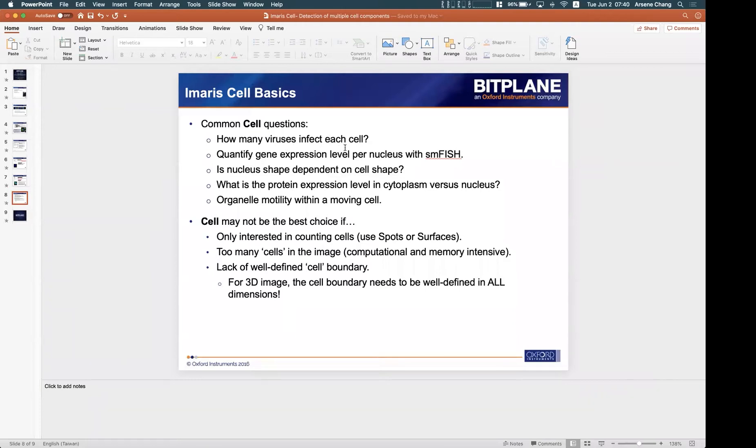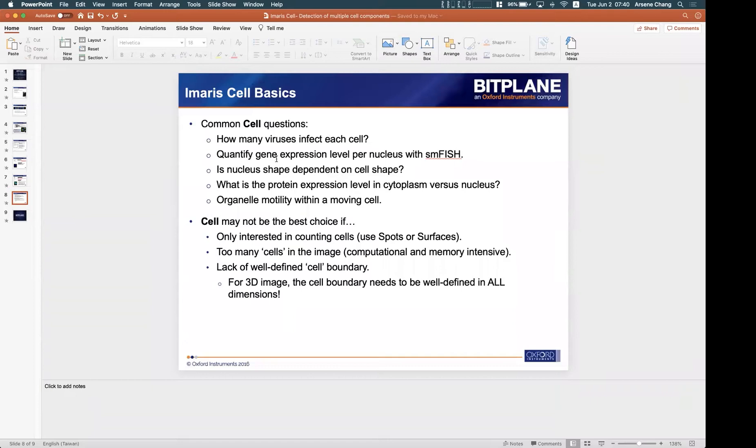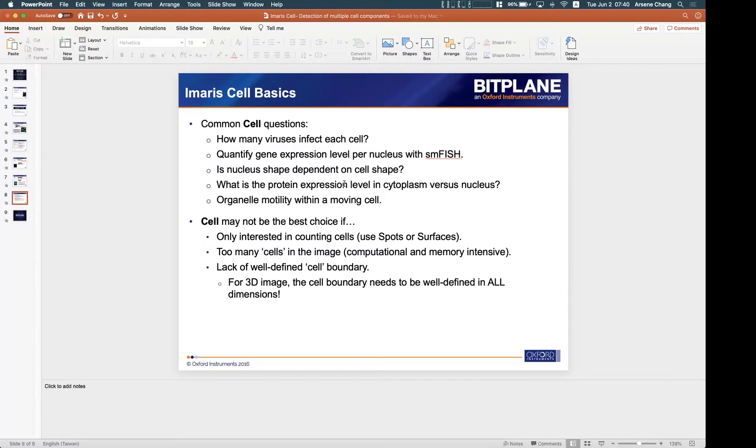Another example: quantify gene expression level per nucleus. We can also detect how many vesicles are there inside each nucleus, and also we have the morphological statistics about the nucleus and the cells.